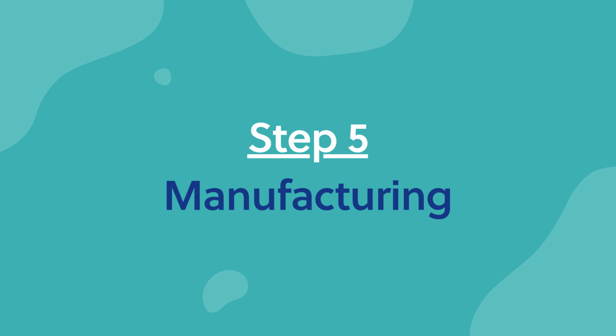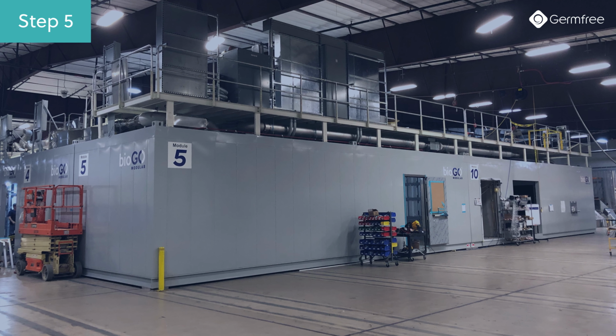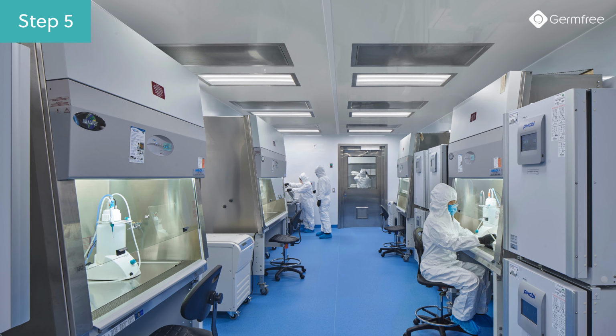With fabrication plans in hand, the project comes to life in the manufacturing phase. Here, our team carefully constructs every structure, system, and component to meet the highest standards. The outcome? Turnkey solutions built for quality, reliability, and long-term performance.